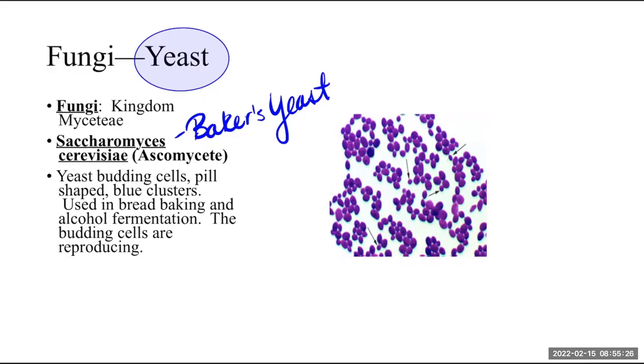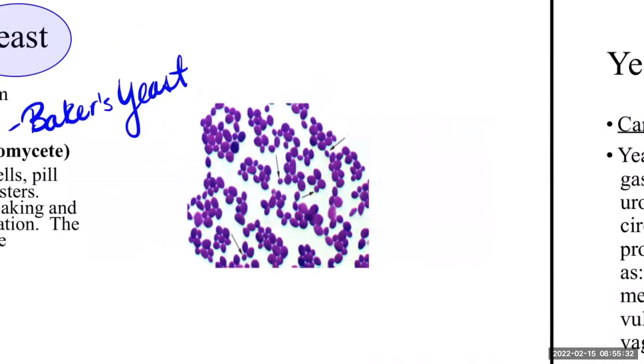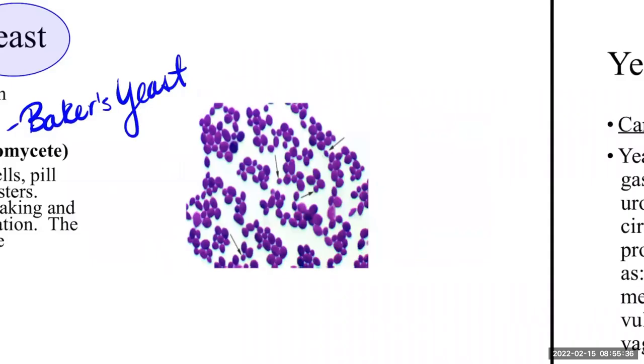So this is commonly used, and there are certain yeasts that actually have been developed specifically for making wine. So it's interesting because yeasts bud. So if you want to see how they reproduce, they actually produce a little bud off of the main cell. And so you can actually see this in some cases. You can see this cell is budding right there. And then, basically the smaller one comes off of the larger one and then grows. So you can see a lot of different sizes of cells. And it's true, the younger cell, the newer cell, is the bud.